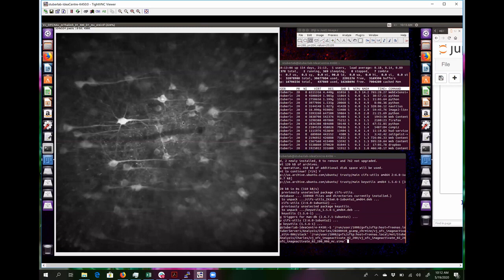So in simple terms, all we need to know is which pixels comprise one cell. Let's say you want to take this cell, you would say the somata are basically these pixels. Anything inside that is part of the cell body. So that's an easy, quick way to know which are the cells that you need to draw.